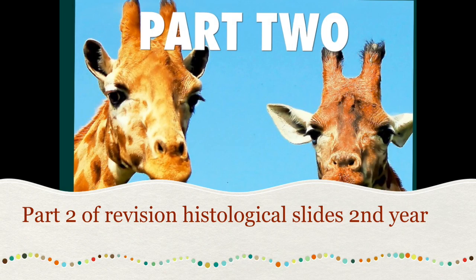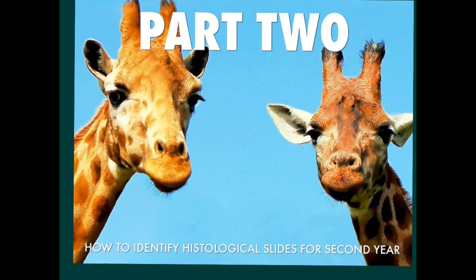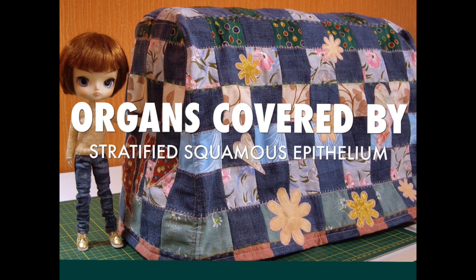Bismillah ar-Rahman ar-Rahim. This is part 2 in our scheme to identify histological slides for the second year. The first subgroup in this video is the organs covered by stratified squamous epithelium.